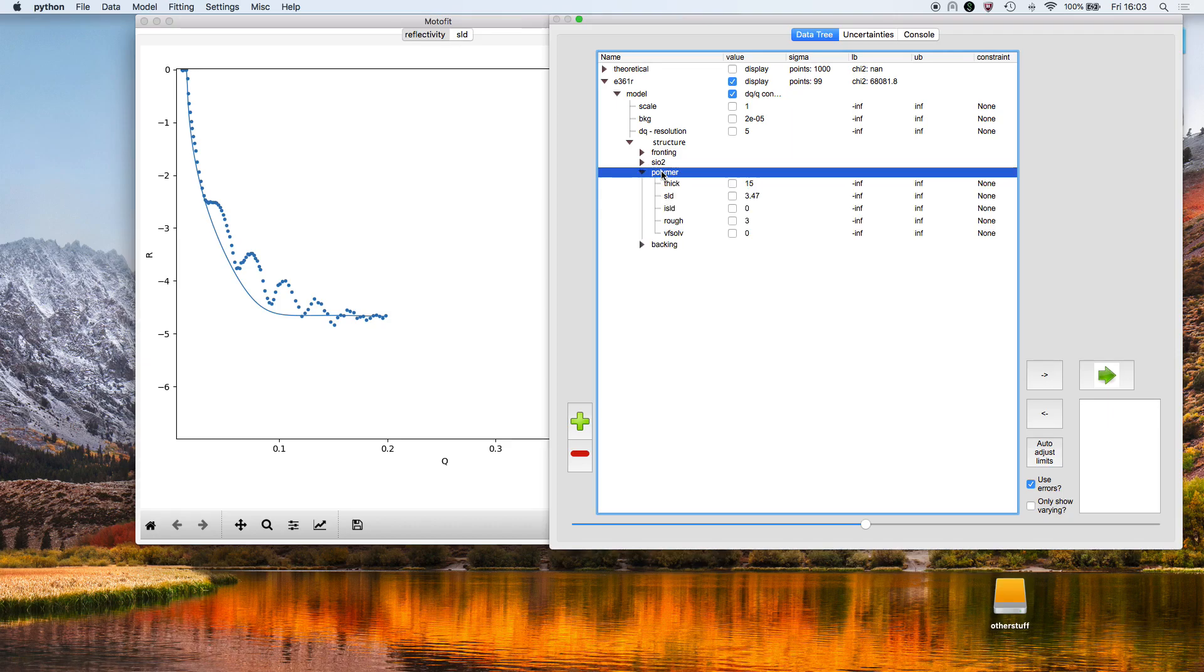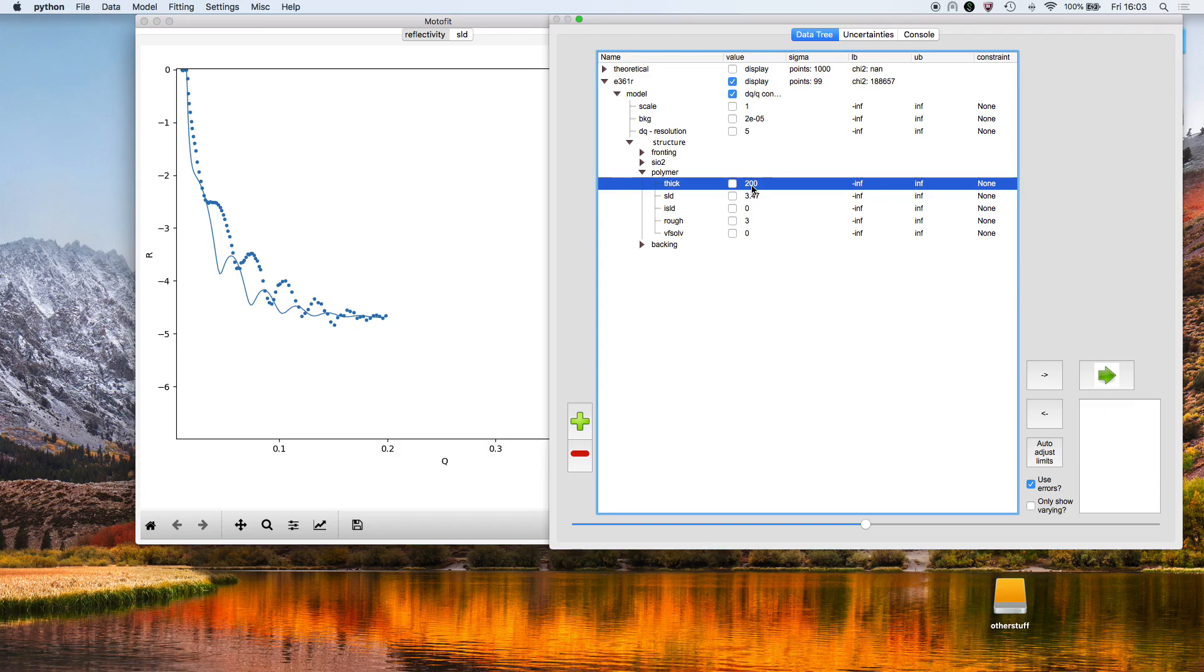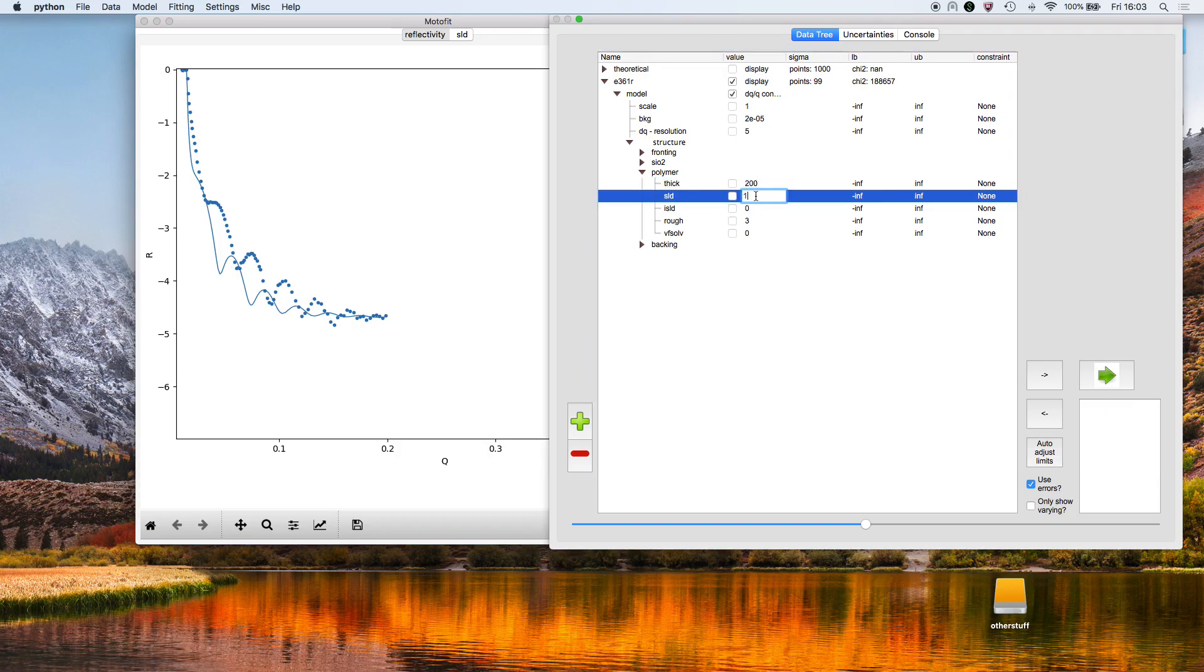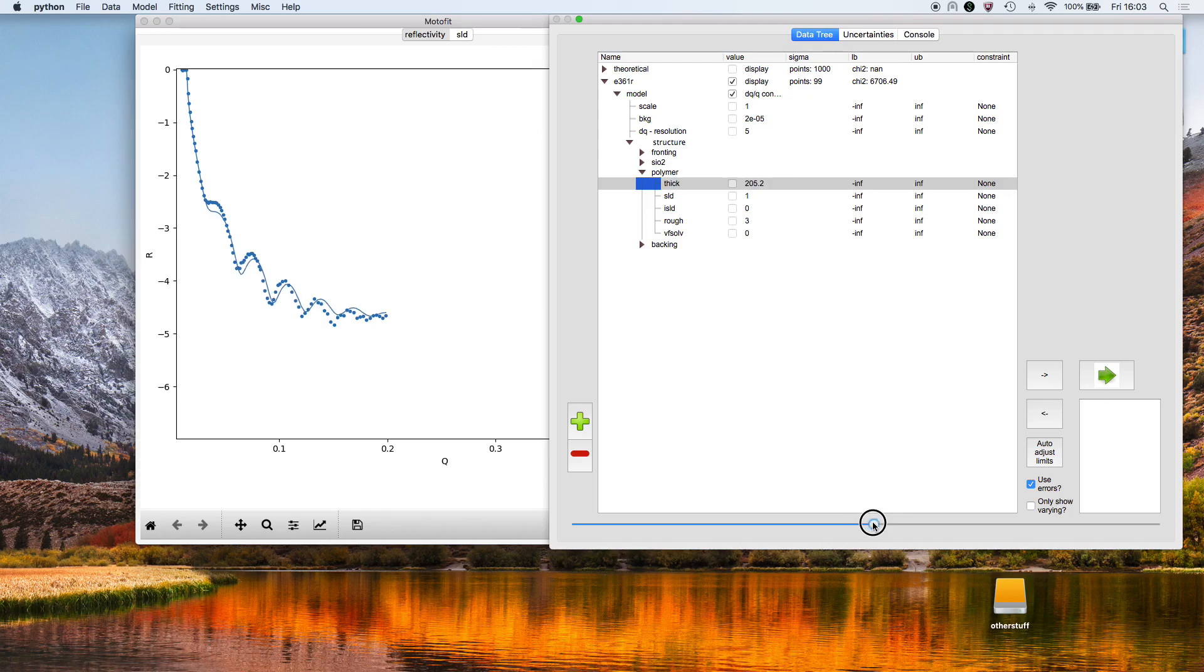I'm going to say that this polymer layer is 200 angstroms thick and has a scattering length density of 1 times 10 to the minus 6. If I select the thickness again, I can use this slider to adjust, to vary its thickness.